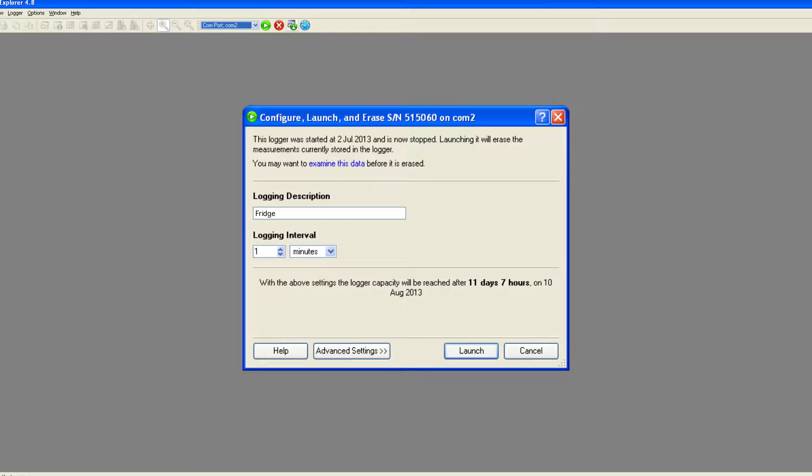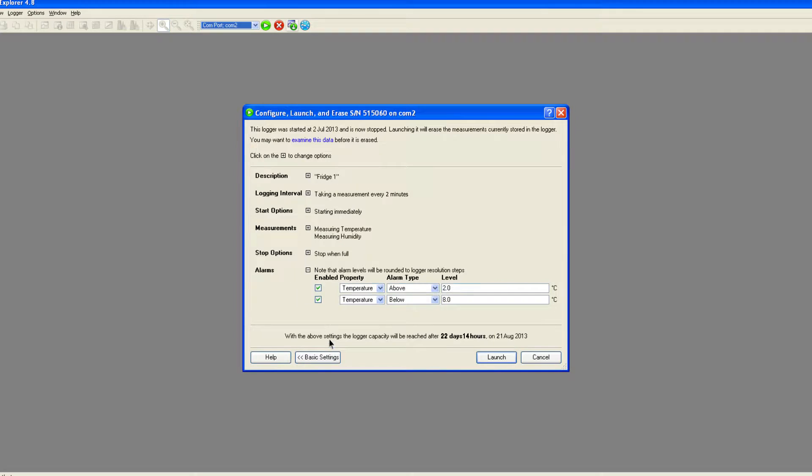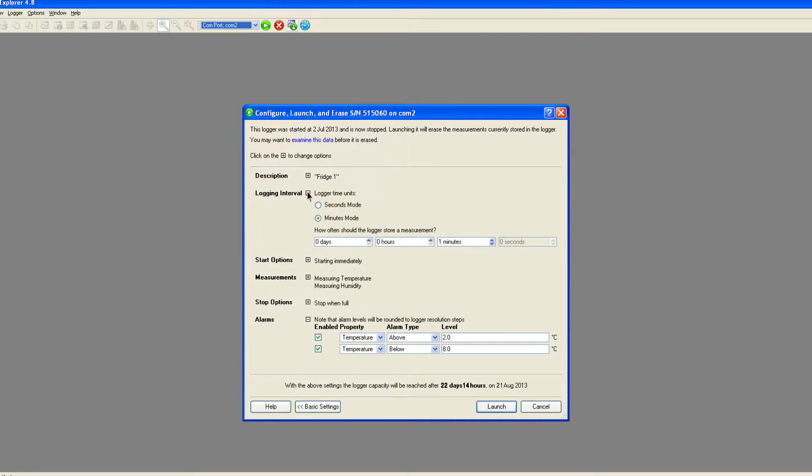Here you can enter a description for your logging run and set the logging interval, that is, the time between each reading. The logger is now ready using these basic settings, but further options to suit specific requirements may be selected by clicking the advanced settings button.